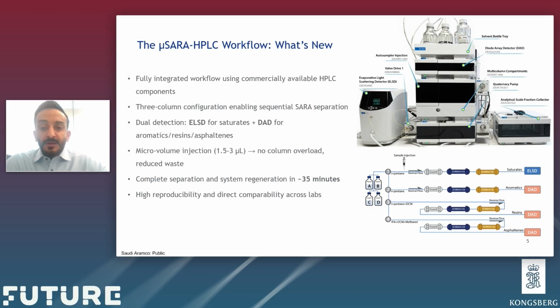The full cycle of the analysis, from injection to column regeneration, finishes in about 35 minutes, which makes this method practical for operational workflows. And because the hardware is fully commercial, the method is reproducible and transferable between different labs.